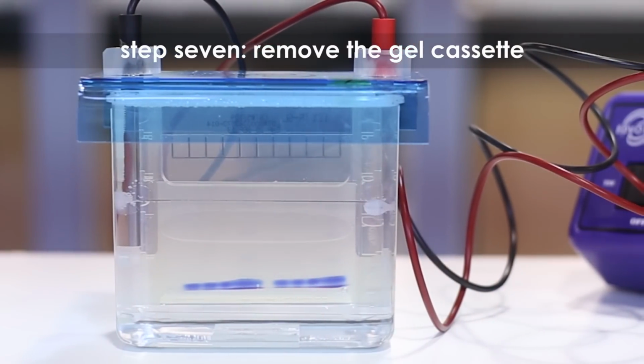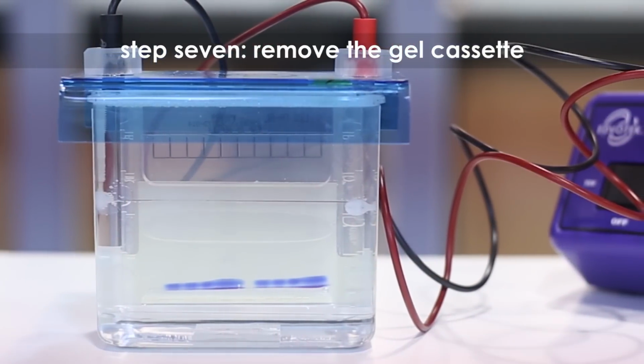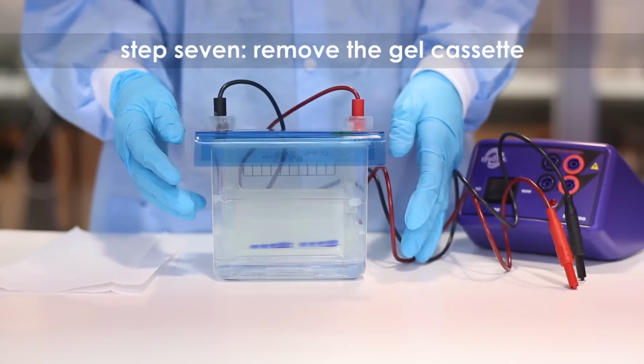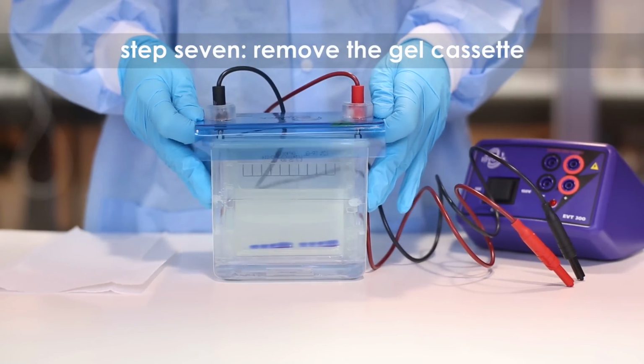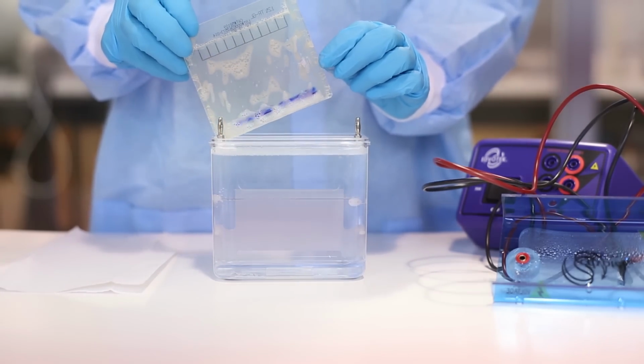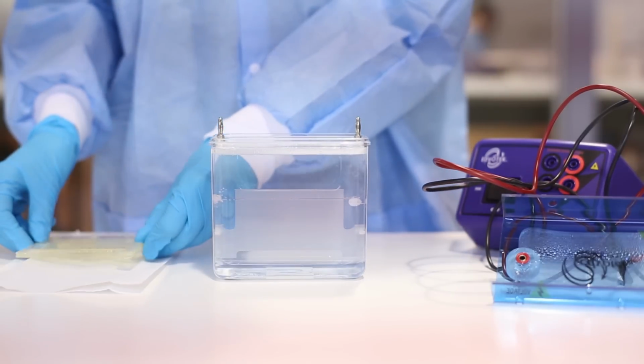Step 7. Electrophoresis is complete when the dye front has run to the bottom of the gel. Turn off the power supply and remove the gel cassette from the electrophoresis unit. Place the gel cassette flat on the lab bench with the large plate facing down.